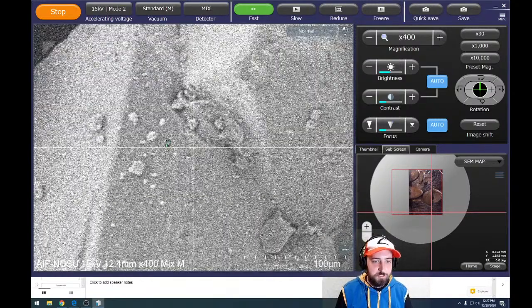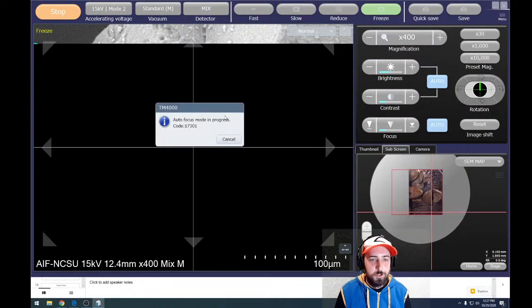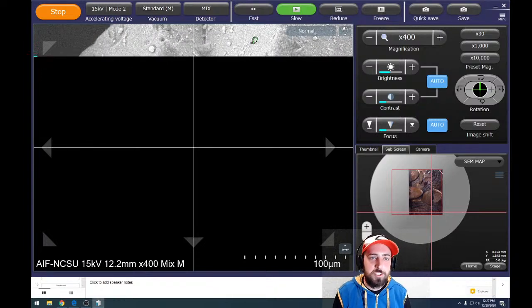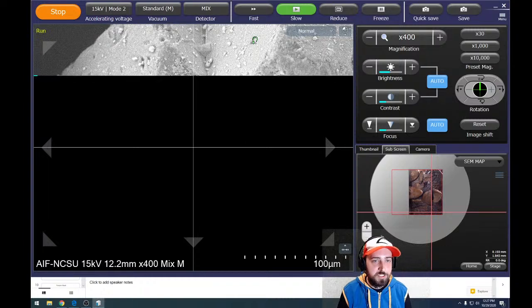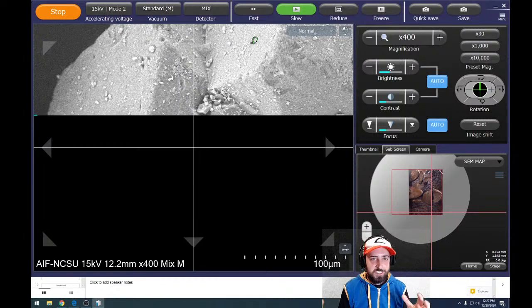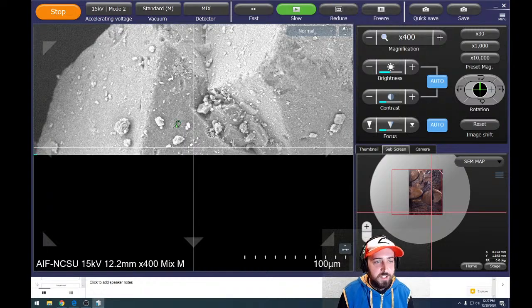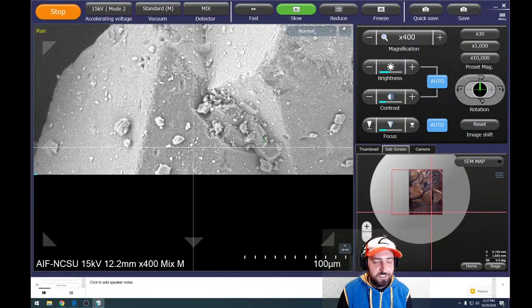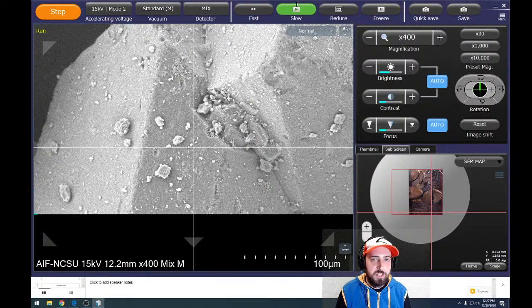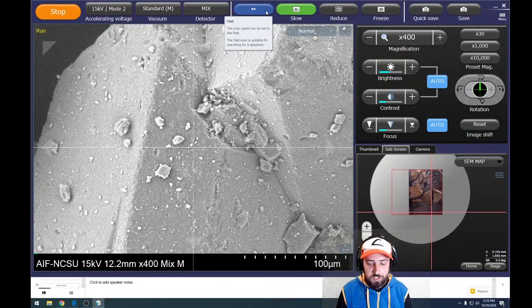If you zoom in even more, you can even see smaller crystals. Not a great focus. We will refocus and then start scanning slow. Even on the surface, we have some smaller particles and crystals. But generally speaking, we're mostly going to see the big ones when we're looking at it or cooking with it. But there can be these smaller facets or different parts of the crystal on it. Holly has some great images of white sugar as well.